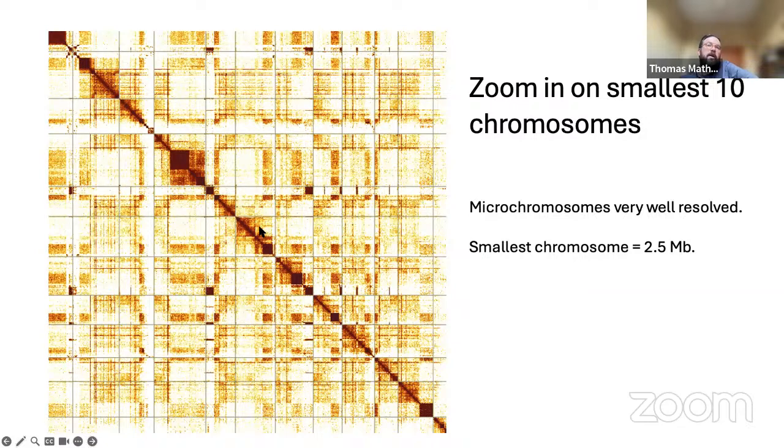So we see these euchromatic regions, which have smooth on-diagonal signal and this elevated Hi-C background, and then we get blocks of repeat across the chromosome as well. A lot of these repeats are found on multiple chromosomes. You can see here, this bit corresponds to a similar repeat over here. There's this repeat here. It's found in this chromosome, this chromosome, this chromosome, all the way along.